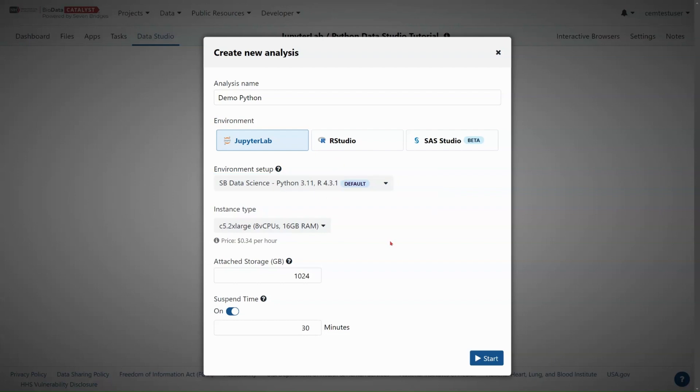The next option is choosing an instance type. For this demo, in addition to showing you how to start up and interact with the JupyterLab cloud environment, I am also going to demonstrate loading an extremely large text file into my Data Studio. My text file is a randomly generated table with 8 million rows and 200 columns and it is six gigabytes in size.